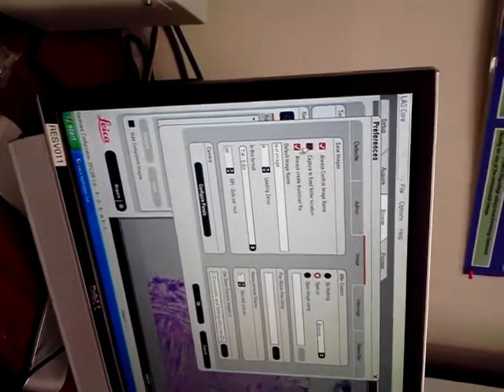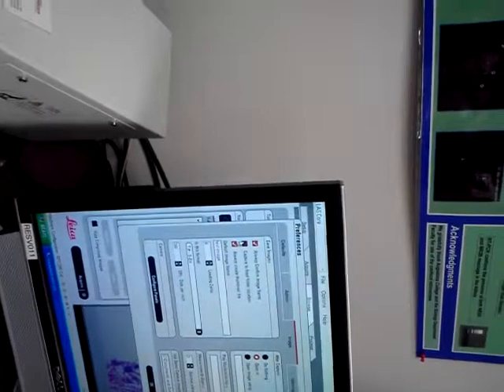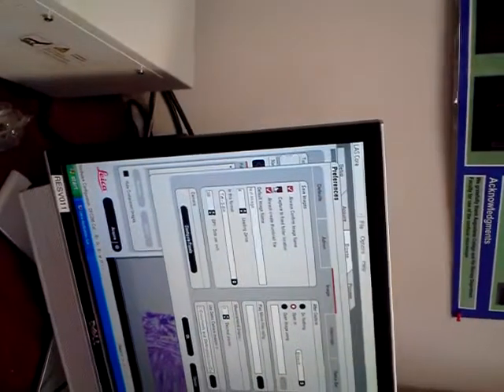We're having it confirm your image name every time you capture an image, so it doesn't really matter where you save it. But there is a way to capture to a fixed folder location, so it doesn't prompt you for a name every time. It'll just keep saving to one folder. When I've got 20 images to do, I can click that box and make a new fixed folder, because we're going to have the Ronin lab, Peterson lab, the Munger lab, and within there are 20 different folders. So there are ways to do it.